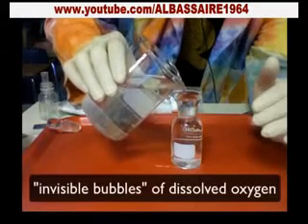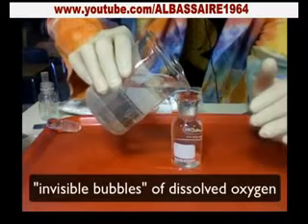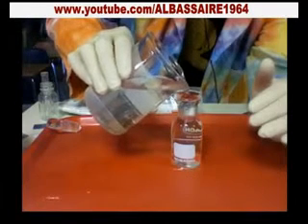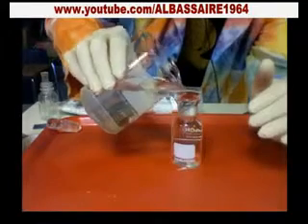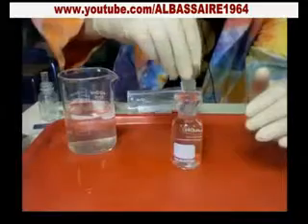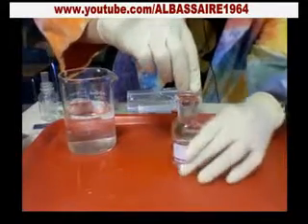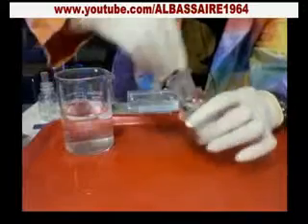You can see that I'm pouring it over the top. Usually you let it run for a few minutes, so you get all of those oxygen bubbles out of the way. Next thing I'm going to do is cap it, forcing that extra water out of the way. It looks like I didn't trap any bubbles in there.